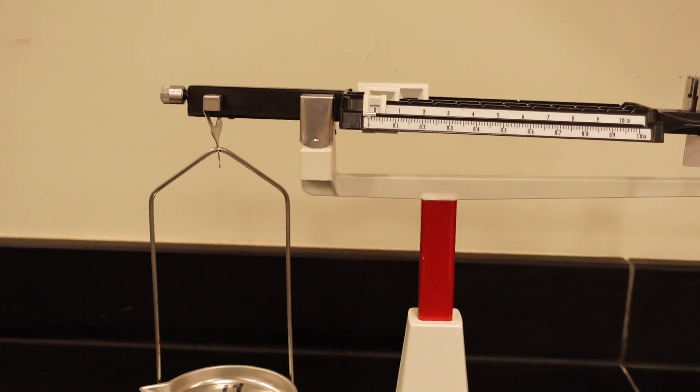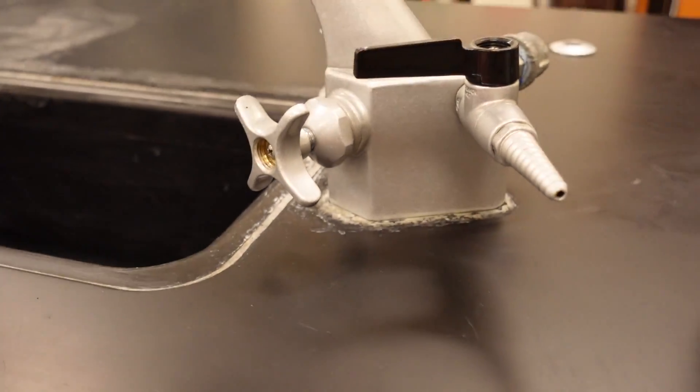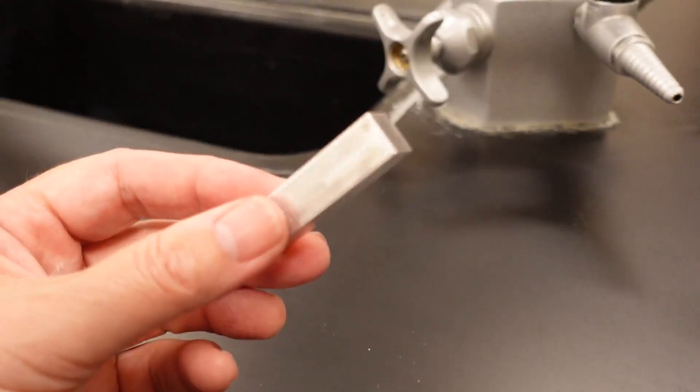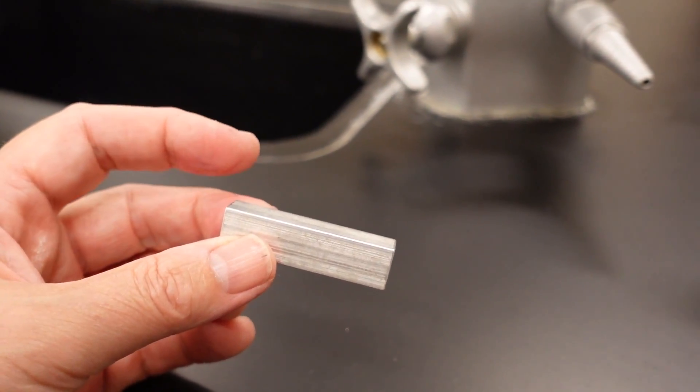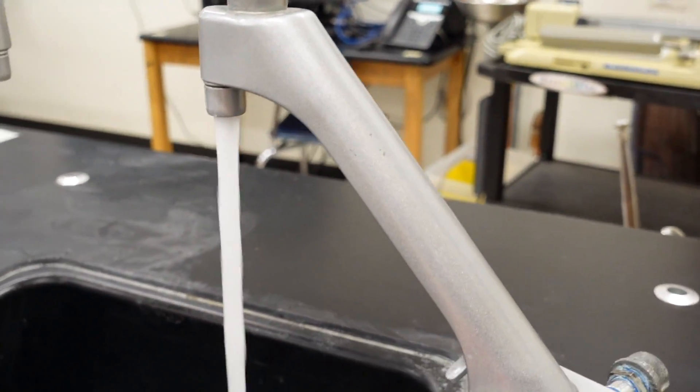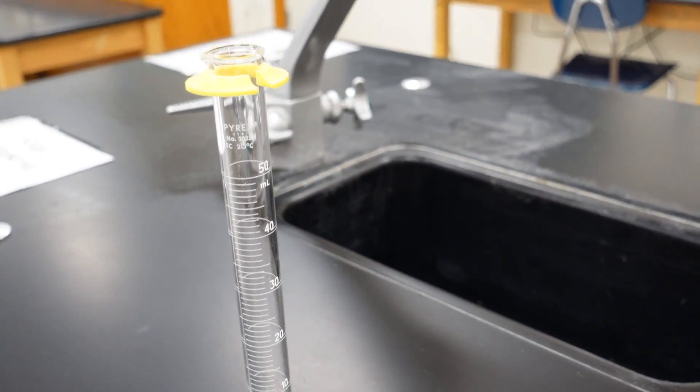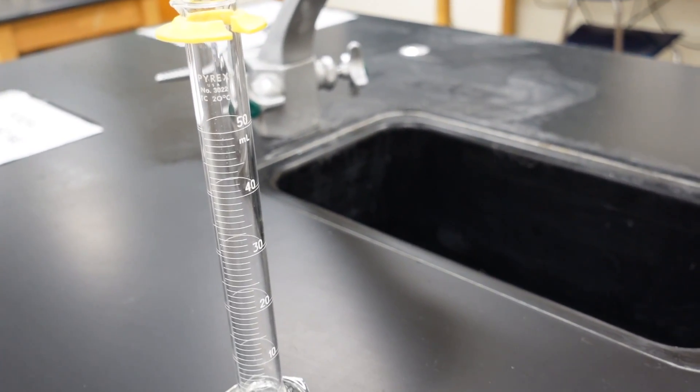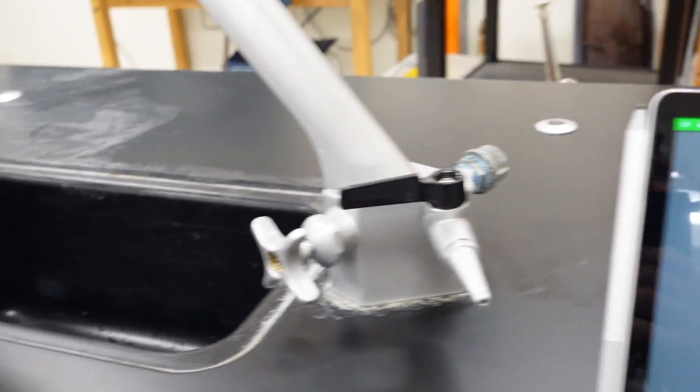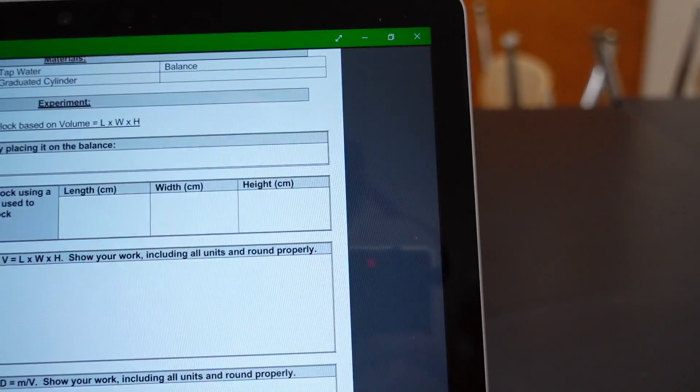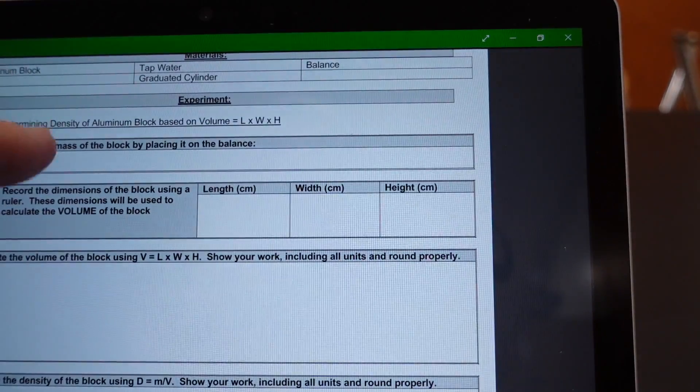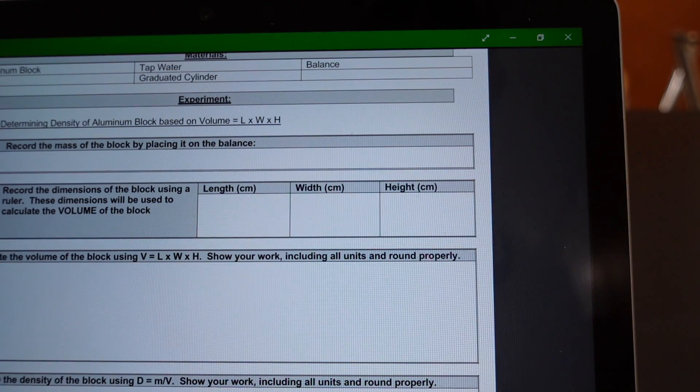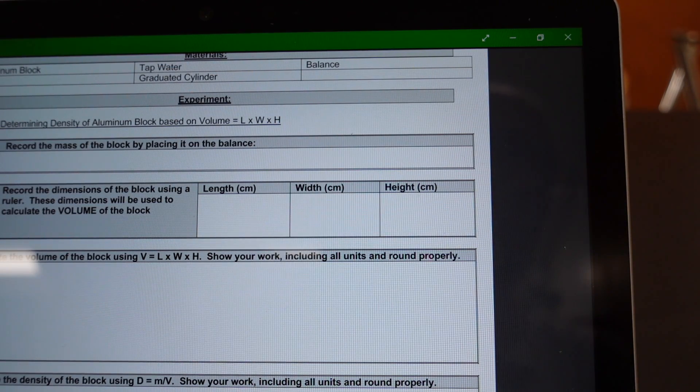To get its volume, however, there are two ways we can get the volume of a regular solid. We can get the volume of a regular solid either by measuring its length, width, and height with a ruler, or by doing water displacement with a graduated cylinder. So, we're going to get volume both ways so that you get an opportunity to learn how to use all three measuring devices. So, let's start off by recording the mass of the block by placing it on the balance.